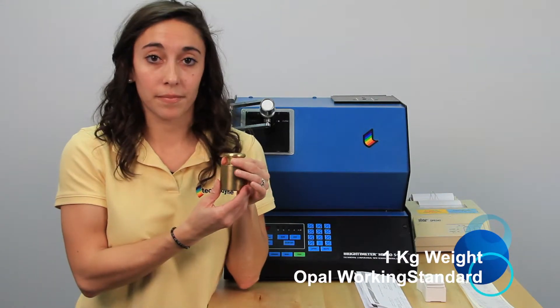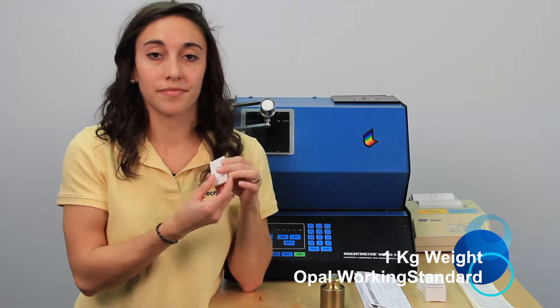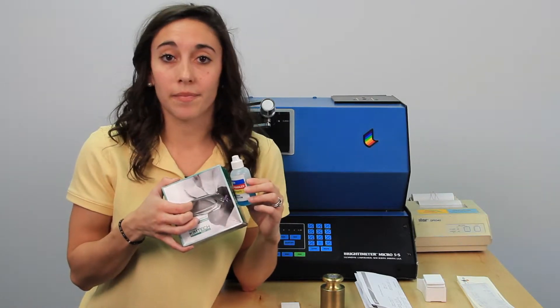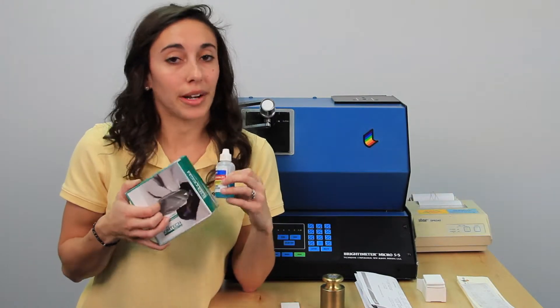The next thing you'll need that came with your instrument is your one kilogram weight. You'll also need an opal working standard. The last thing we suggest you have on hand is a cleaning solution and a non-abrasive, non-optically brightened cleaning wipe. Once your instrument is fully warmed up and you've got all your things together, you're ready to go ahead and get started.